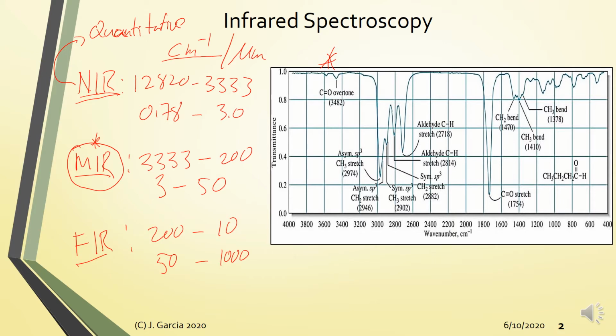But nowadays there is an NIR instrument based on recording standard samples of chocolates, meaning chocolate samples with known amounts of proteins, fats, and carbohydrates from your conventional standard methods.